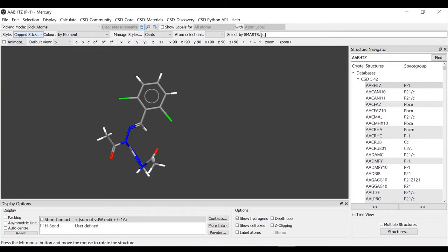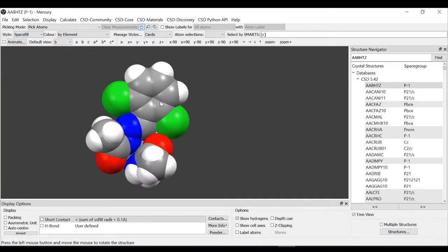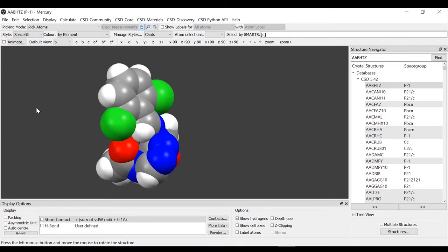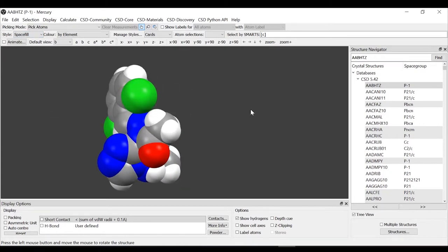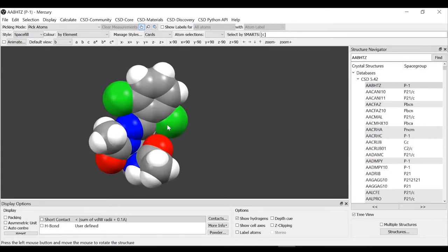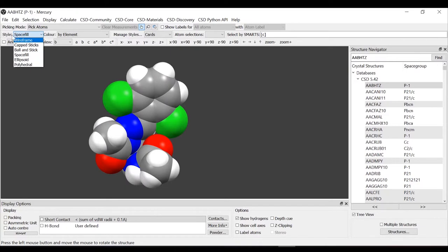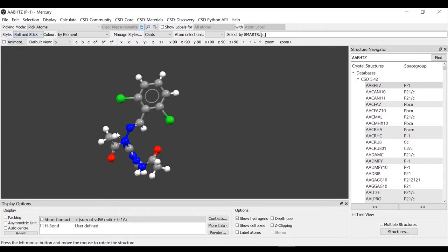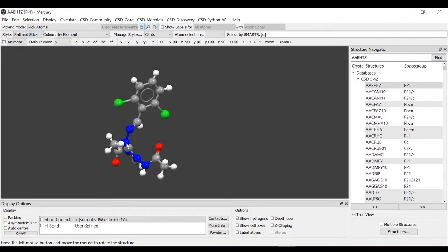We'll try again from this. We can go to the drop-down menu, style, space fill. We can see again a different representation. Let's go back from style back to ball and stick, the initial representation.